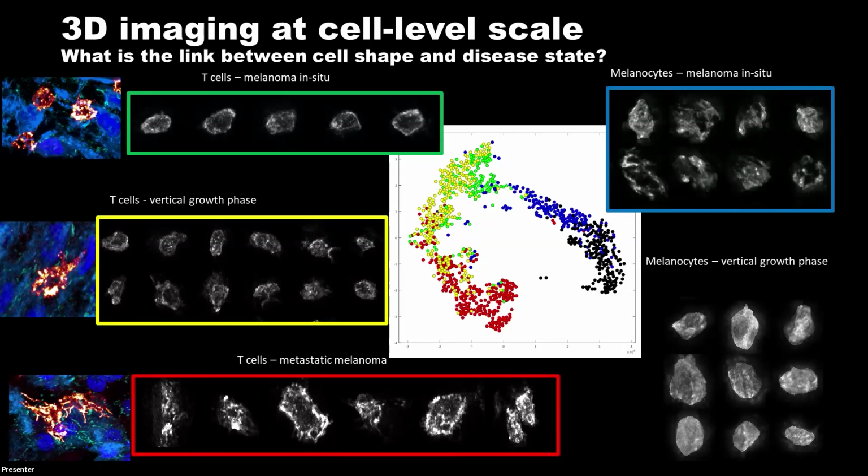It would be interesting to inspect the cells that overlap near the boundaries of these clusters and see why they are some of the first of their population to change shape. Who are their neighbors? Are they attacking tumor cells? Are they becoming more activated by antigen-presenting cells? These are some of the questions that interest us and are relevant to many diseases.